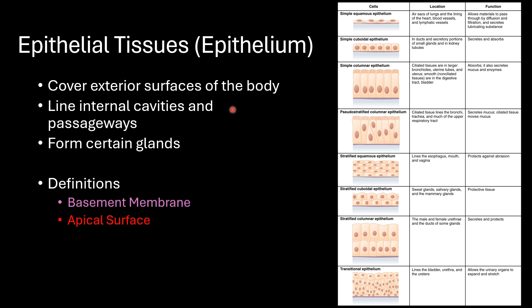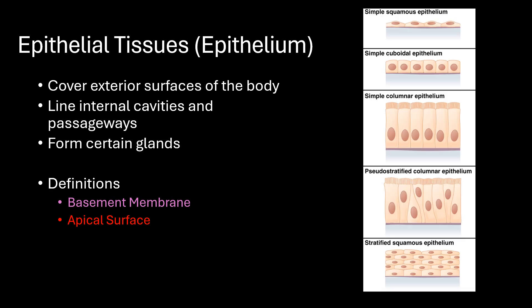A couple of terms you'll hear throughout this video are the basement membrane and the apical surface. The basement membrane can also be referred to as the basal surface. It is the edge at which the cells are in contact with other tissues below it — therefore it is the base and we'll use that as our reference point. On the bottom image, it's that purple line right there; below it we would see other connective tissues. In contrast, on the top we have our apical surface — it's our free edge and it's not in direct contact with other cells.